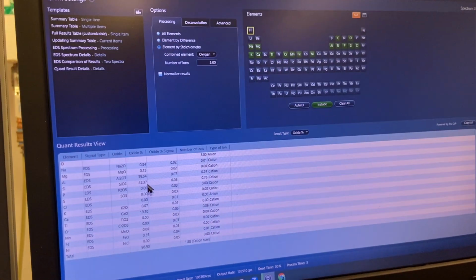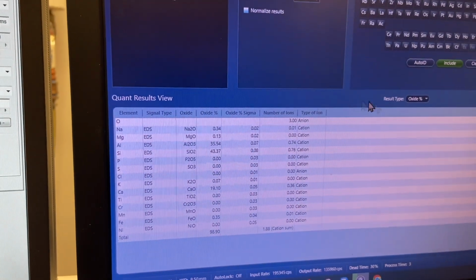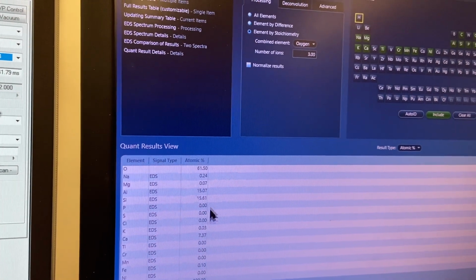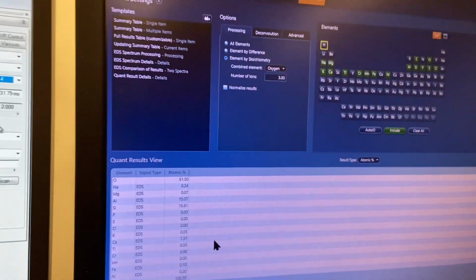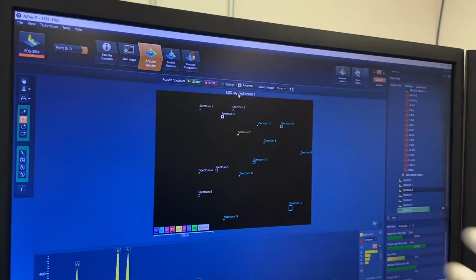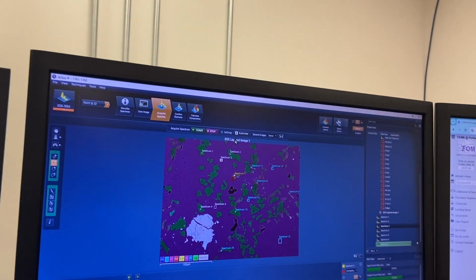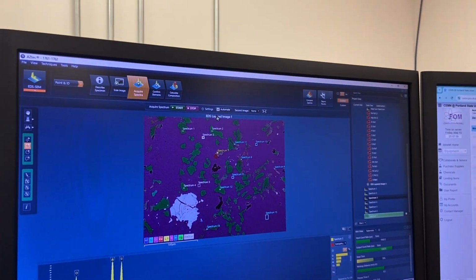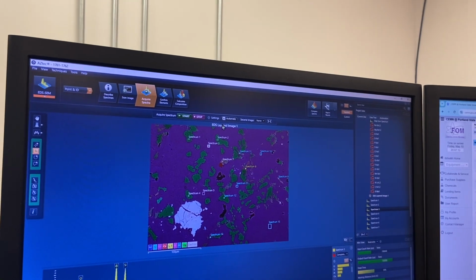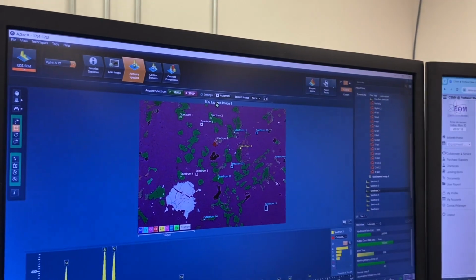So it might look a little weird if you're used to seeing this from the perspective of different minerals, but it doesn't change much. I'm just trying to see that, yeah, this is a calcium-rich feldspar, very low in sodium. And then if I get the AN number, we're looking at 97.5. Yeah, this is lunar. So I'm getting lunar values on feldspar, lunar values on olivine. So yeah. Congrats, we have a lunar meteorite. It's that easy. And unlike something like a hand specimen, the chemical composition does not lie. It is essentially saying this is what your sample is made of.